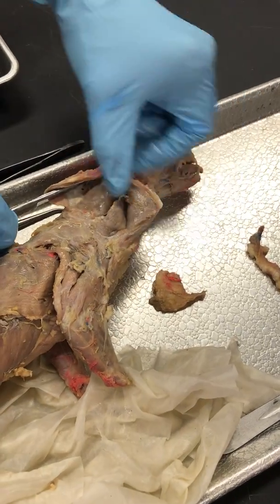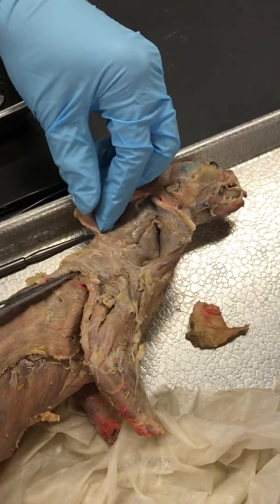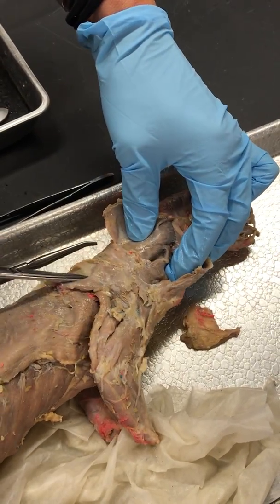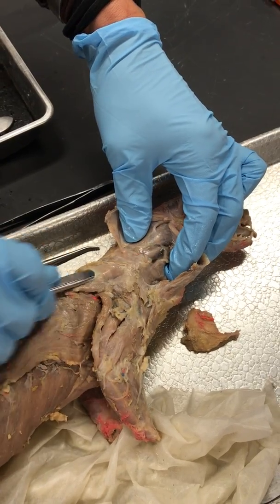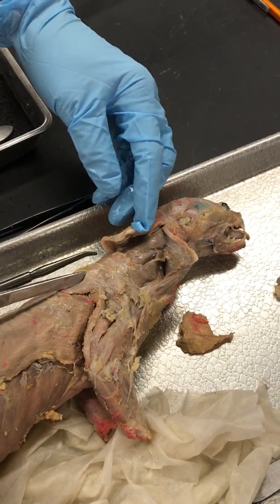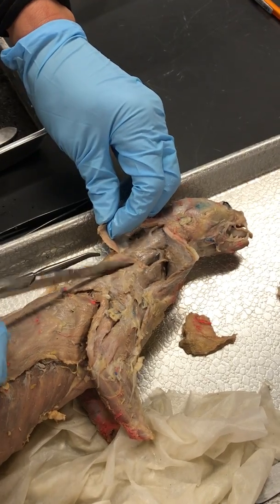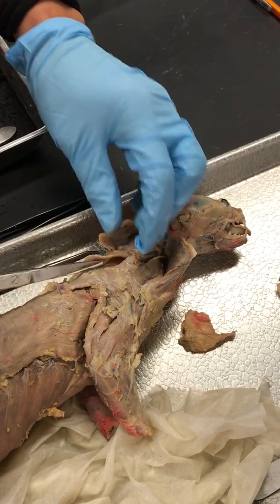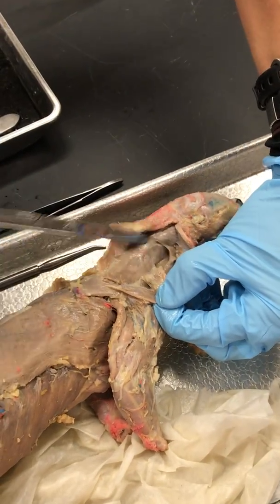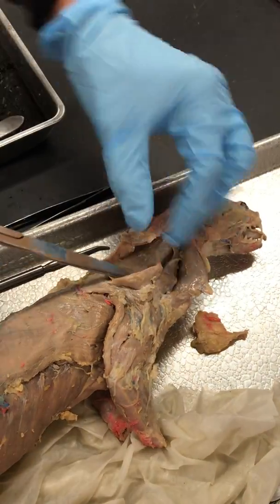The other muscle you have to know is Levator Scapulae. In order to see Levator Scapulae we have to go up under this muscle right here. This is Cervical Trapezius and it's almost right on top of his shoulder. So if I cut that one and fold it back, now I can see Levator Scapulae.